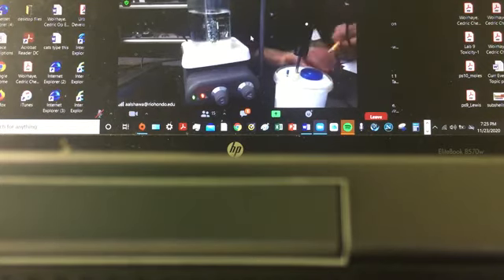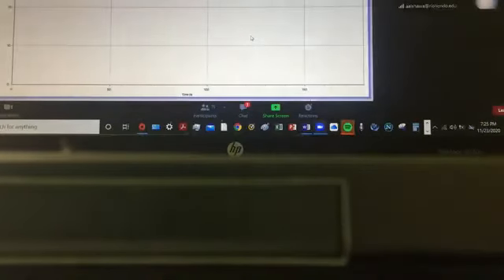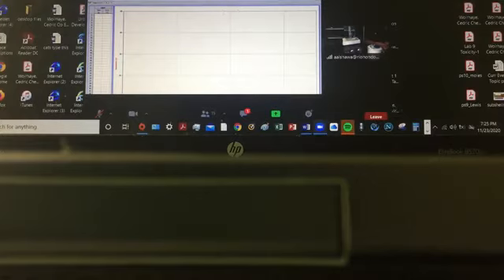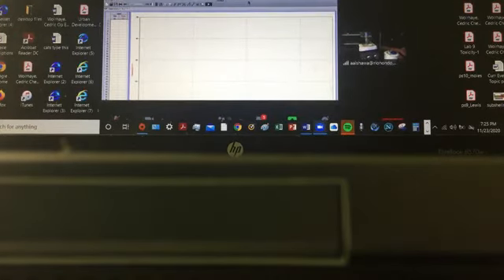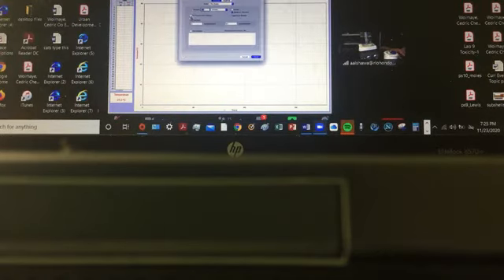All right. Now for the calorimeter setup, here's the preparation part of it. So I'm preparing a software, and that software has the following features. I'm going to go to that clock and let it go continuous. You can collect data based on set time, or by continuously collecting data.